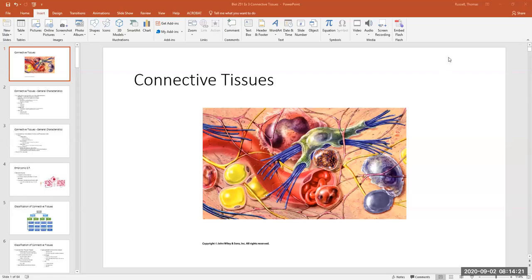Here's a connective tissue PowerPoint that I just uploaded into our Canvas site, so you'll be able to grab that later on. The majority of this PowerPoint has a whole bunch of pictures in it that we're going to go over. You have several different views of the connective tissues from the slides, which will help you out in identifying everything.